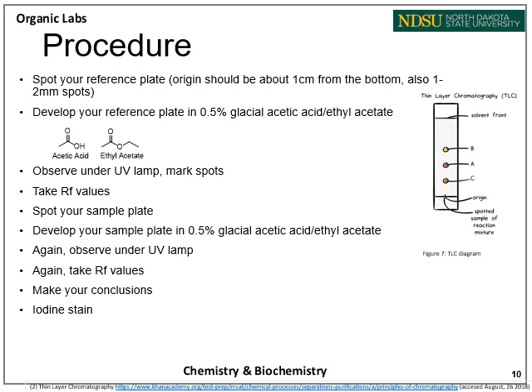Next, you're going to spot your sample plate. And the sample plate will be developed the same way as the reference plate. Once again, you're going to observe it under UV lamp and then take the RF values just like the reference plate, and you're going to make some final conclusions about what is what using your two plates.